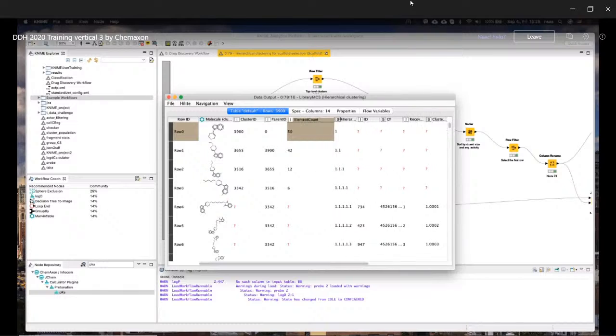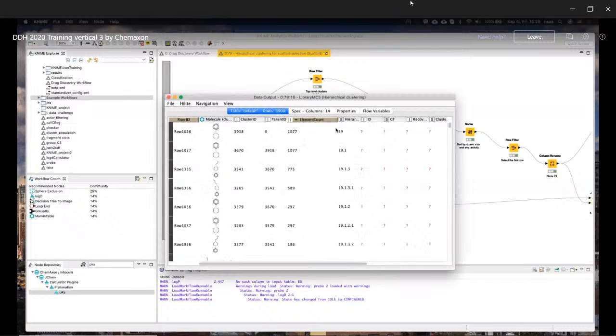It will also tell you that the element count of this hierarchical family is 50. So what you can do with this is, for a first look, order this and check which is my biggest family, which is the molecule that has the most members and is therefore more often present in the set.